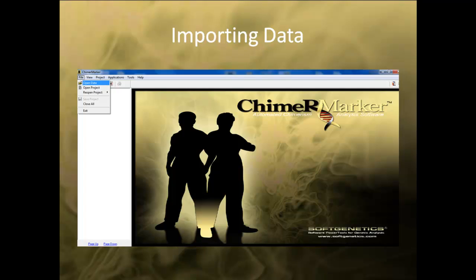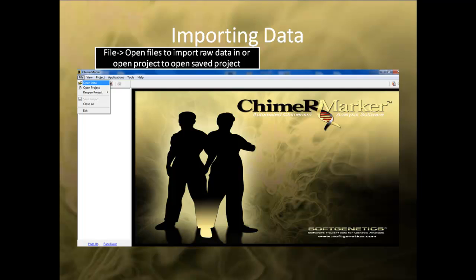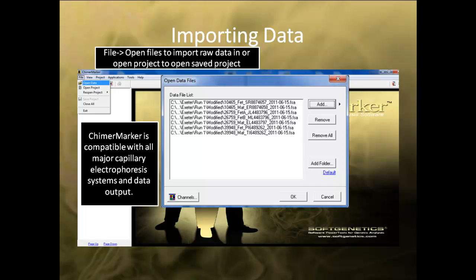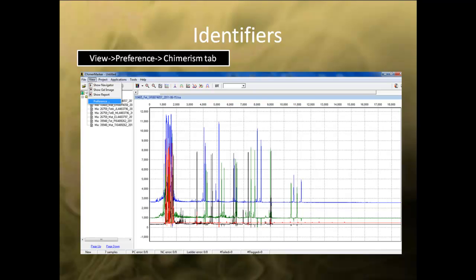We will start the webinar by importing raw FSA files into the software. You can use the file drop-down menu to input raw data or open previously saved project. Select File Open Data to bring up the Open Data Files dialog box. In the dialog box, select Add and navigate to the data to import it into ChimerMarker. The software is compatible with all file output from all major capillary electrophoresis systems. After importing the data into ChimerMarker, the next step is to set identifiers for the sample.